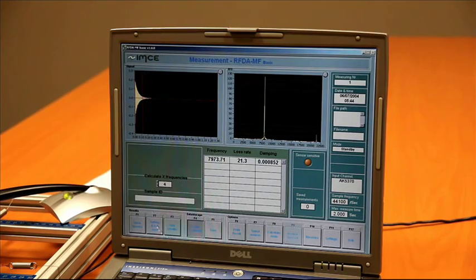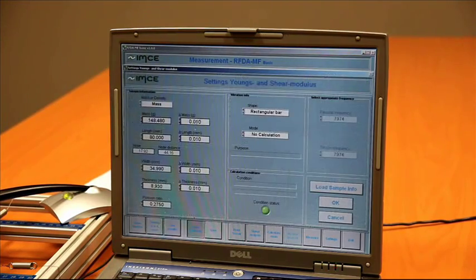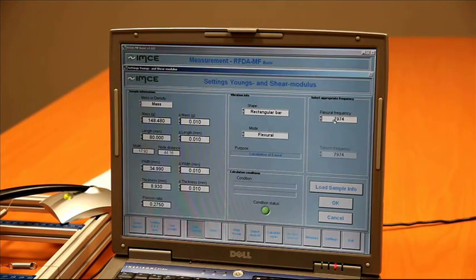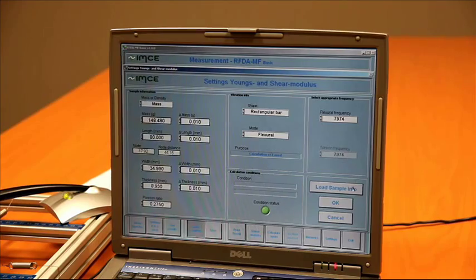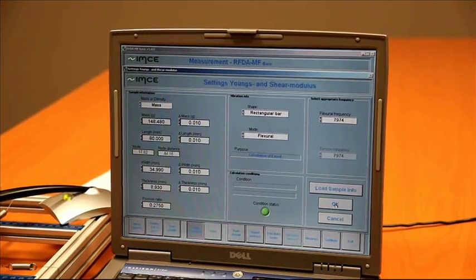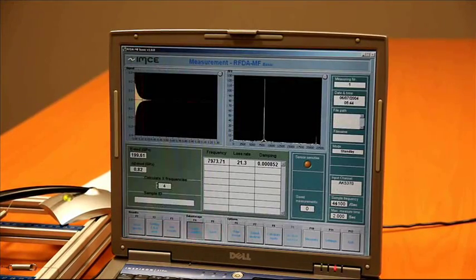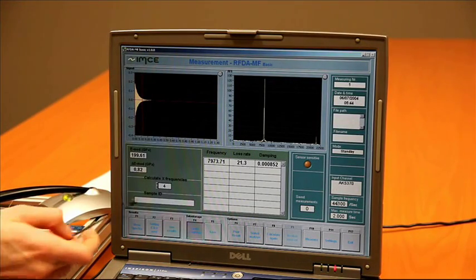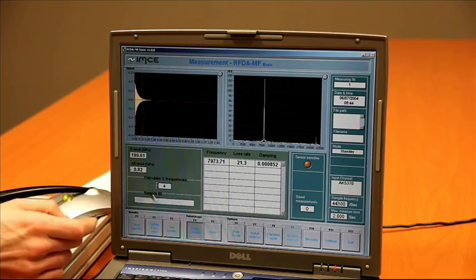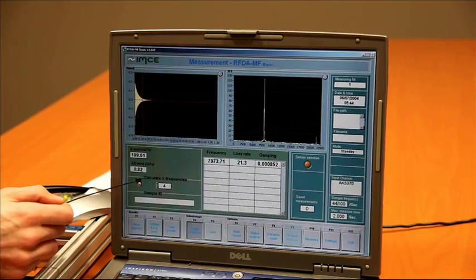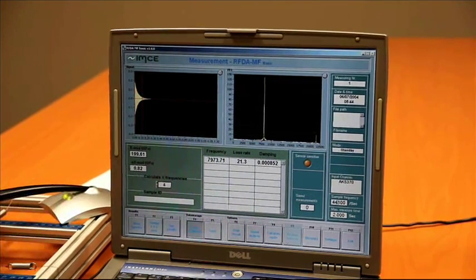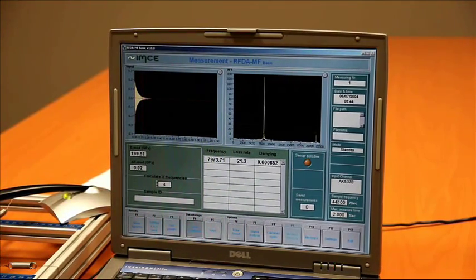Now we tell the software that we measure the flexural vibration and we select the correct vibration. Now the software calculates the Young's modulus and the error that was calculated on the Young's modulus.